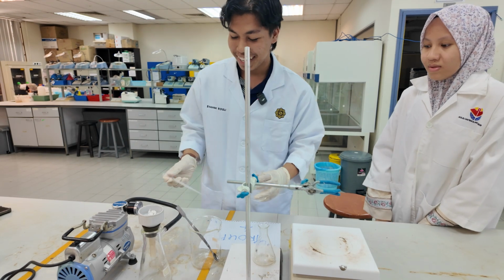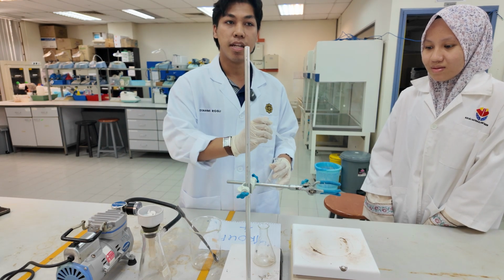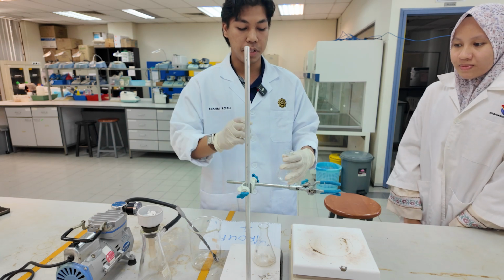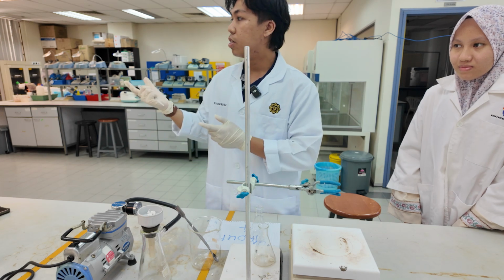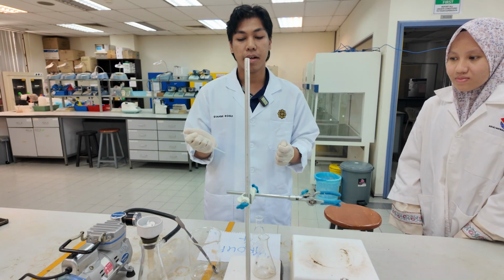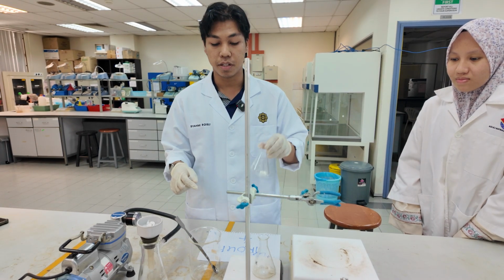Yes, that's good. Make sure you put it in the cylinder first, and then you can put it in the mixture flask. And then for water, use the distilled water that we have there, put it in the graduated cylinder, and then you can put it in the mixture flask.